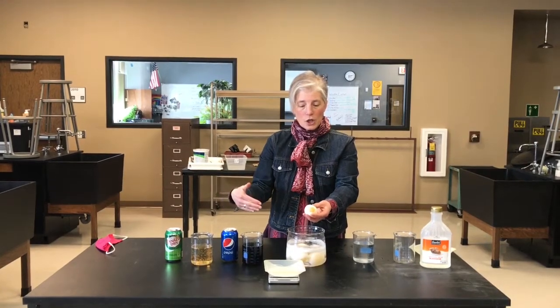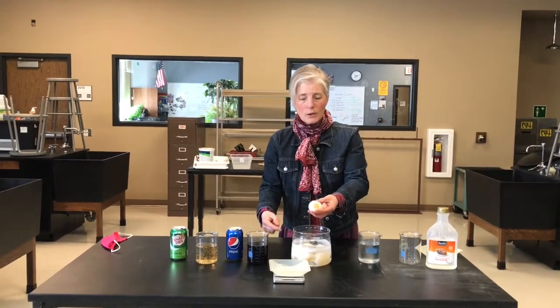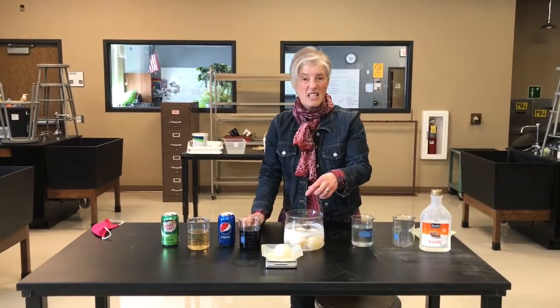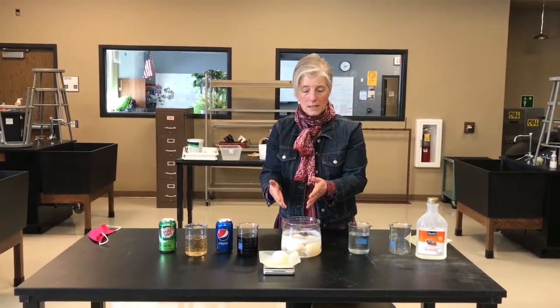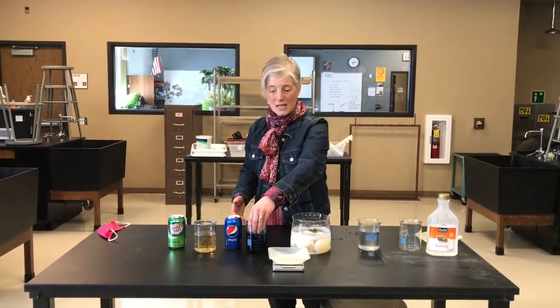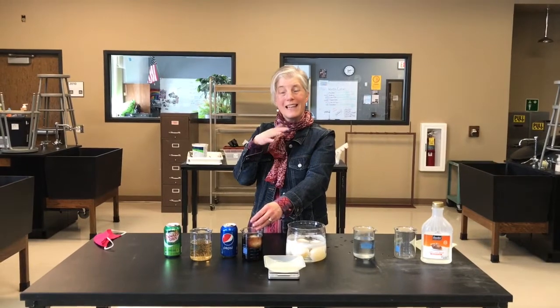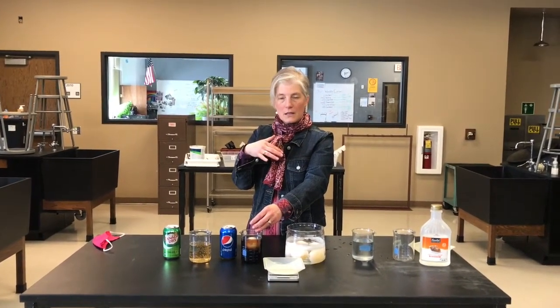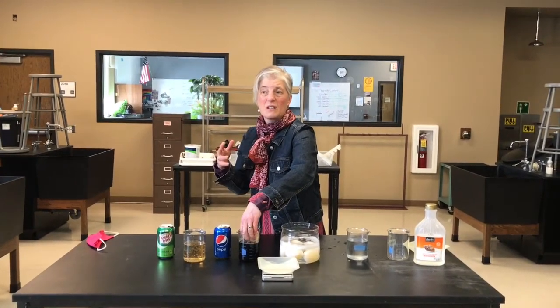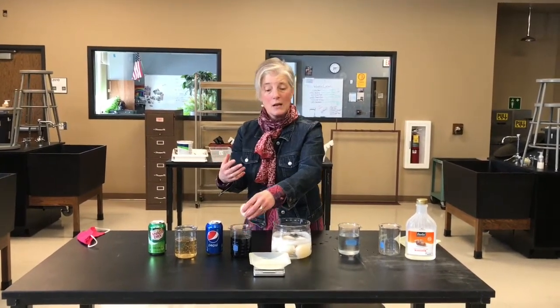In order to show you the results, because how are you going to know if water moves? It's not like you can see it moving. So what we're going to do is weigh each egg. Squishy, it's really squishy. We're going to weigh each egg, give you the weight before, the weight today. Then we're going to put the egg into the solution and let it sit overnight. I want you to be thinking, if water goes into the egg, what will happen to the egg? Will it gain weight or lose weight? If the water in the egg comes out, will the egg gain weight or lose weight? So we'll put it in here, get back to you, and weigh it a second time.